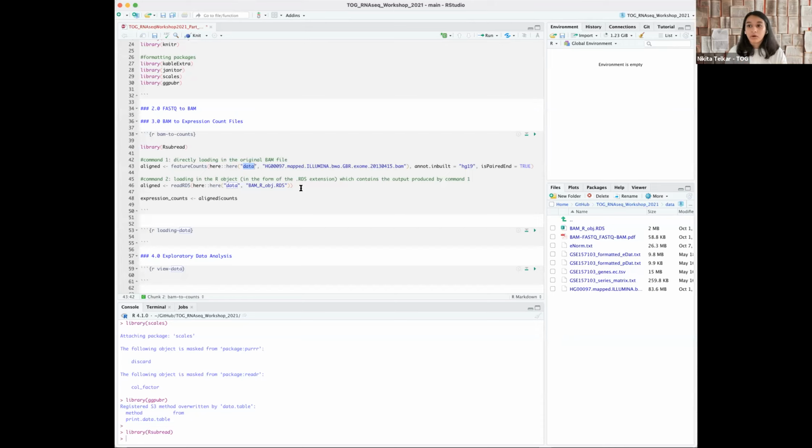So if I had put in, it's present on my Z drive and folder Nikita in GitHub, you won't be able to load that because that's on my local computer. So here helps you with making sure that your data is reproducible. These little 2 dots over here mean that I'm going to use the here command from the here package, because there are 2 commands with the name here, present in different packages. So sometimes you have to specify which command from which package. You put the double colon here, and then it knows that I'm using this from the here package.